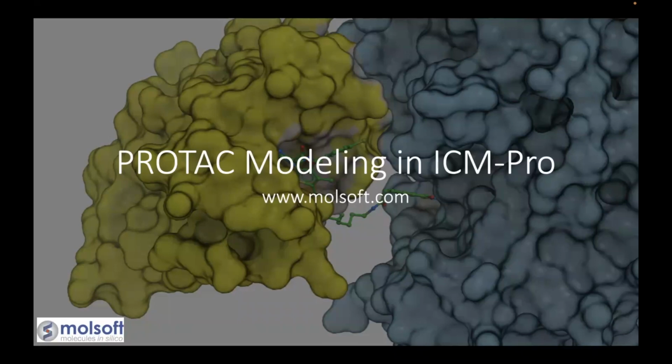Today's webinar is on PROTAC modeling in ICM-Pro. This webinar is being recorded and will be uploaded onto YouTube.